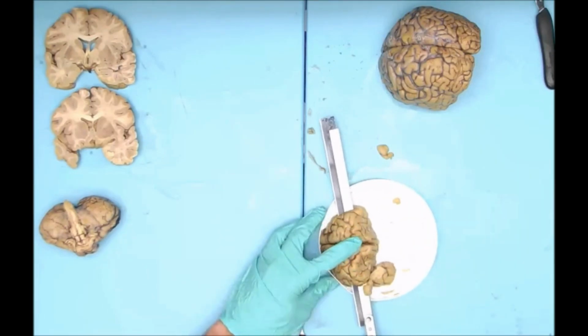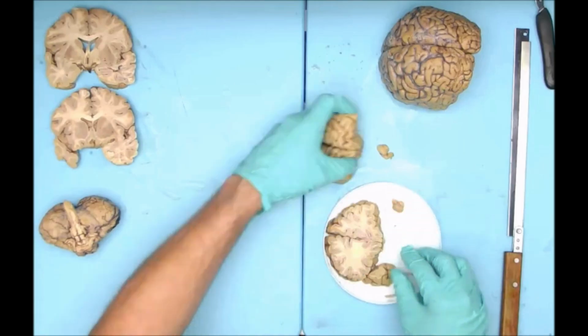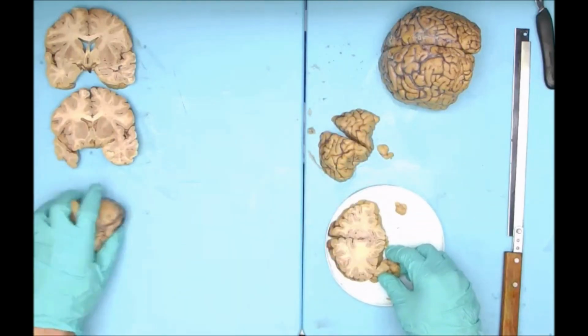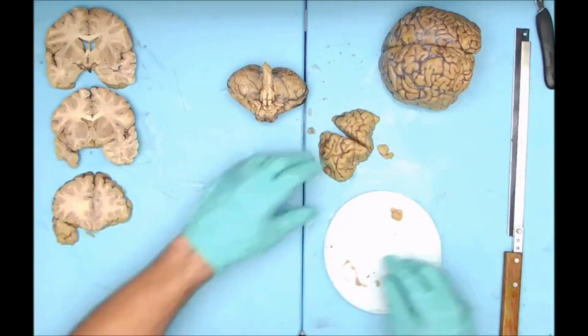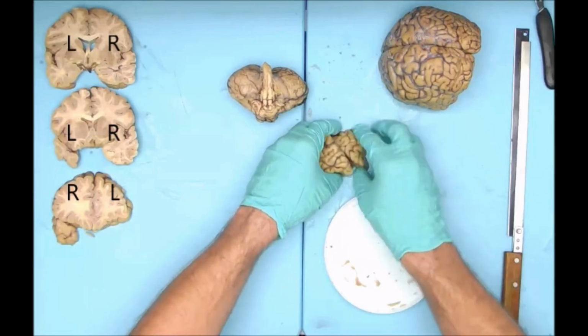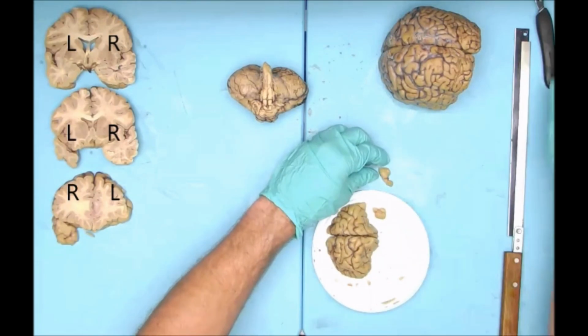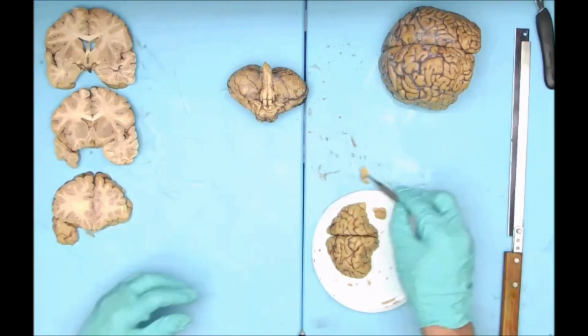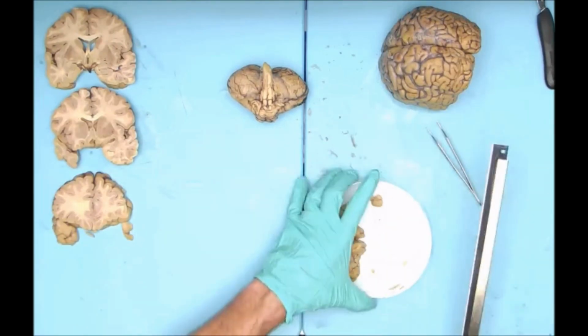As you notice here, I make an error and I do not flip it over. And so the laterality has changed here. And that's real important to make sure, once again, that you lay out the slices the same. If you decide to flip them over like that, make sure you do them on all the slices in that particular half of the specimen.